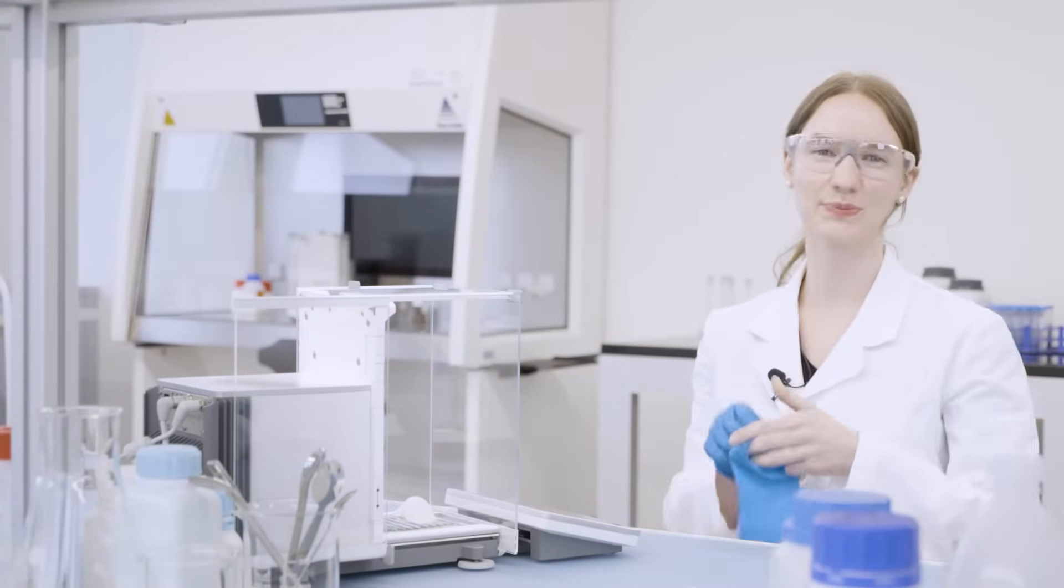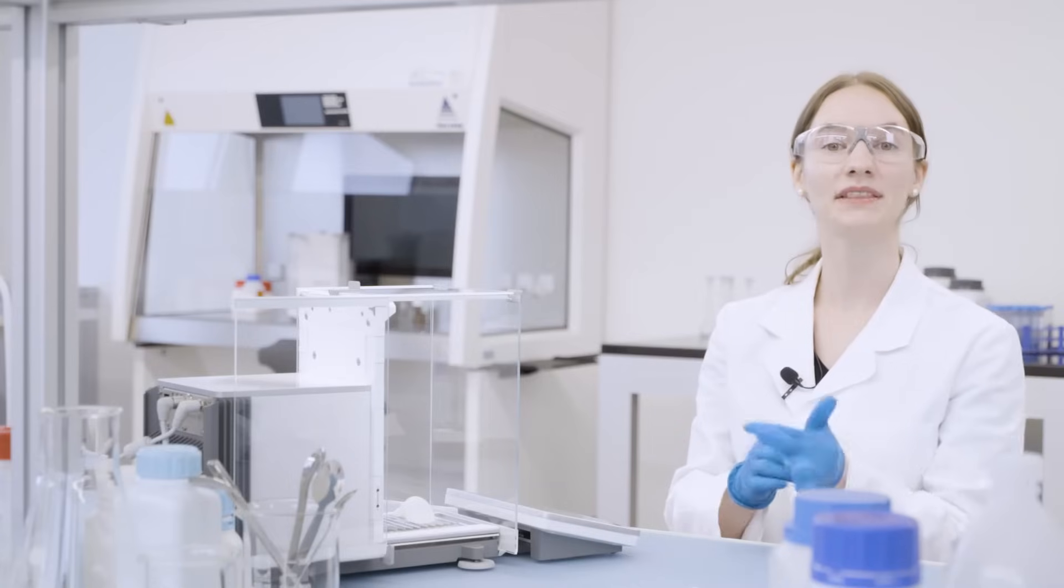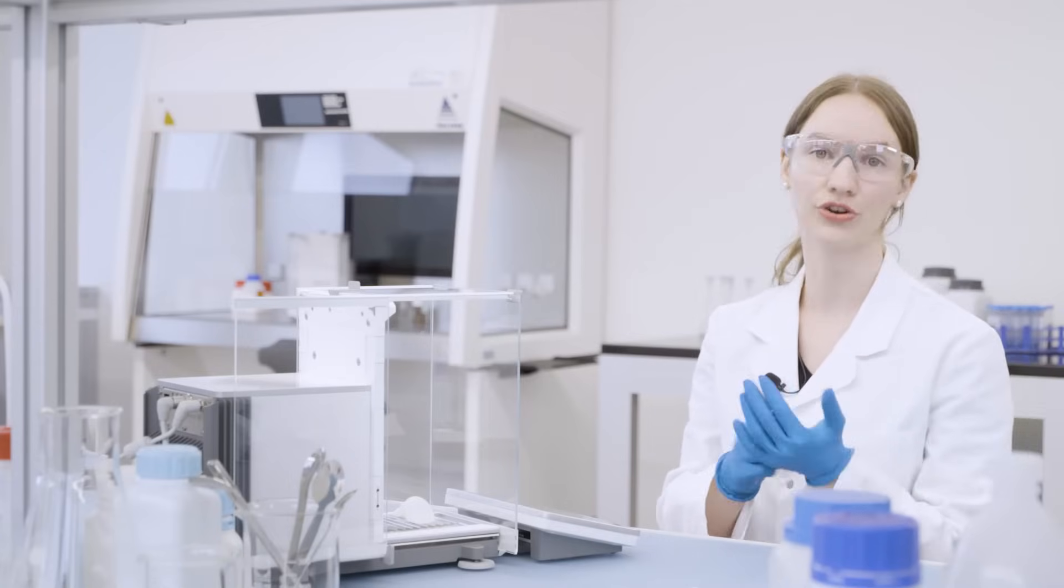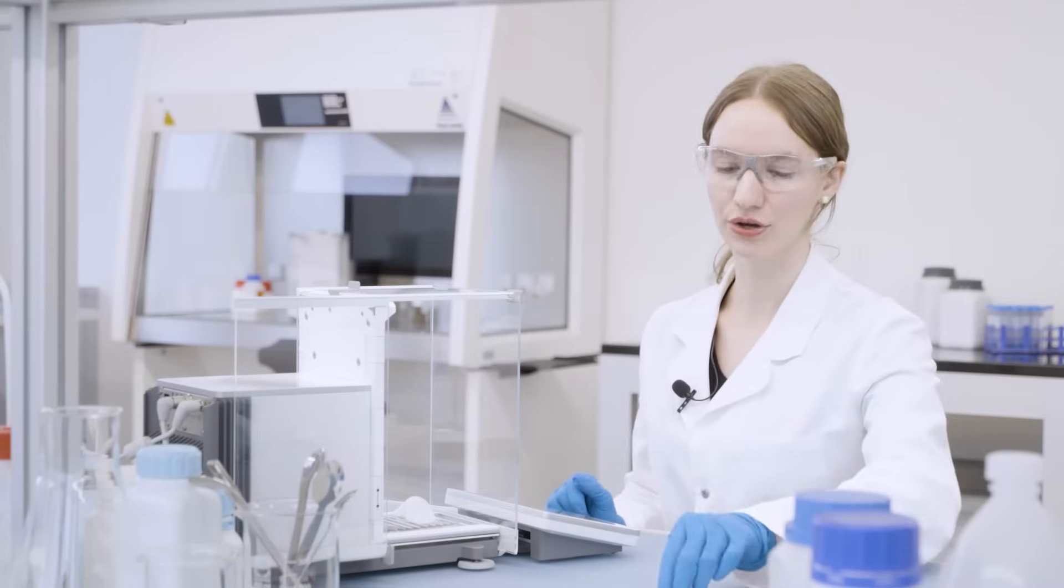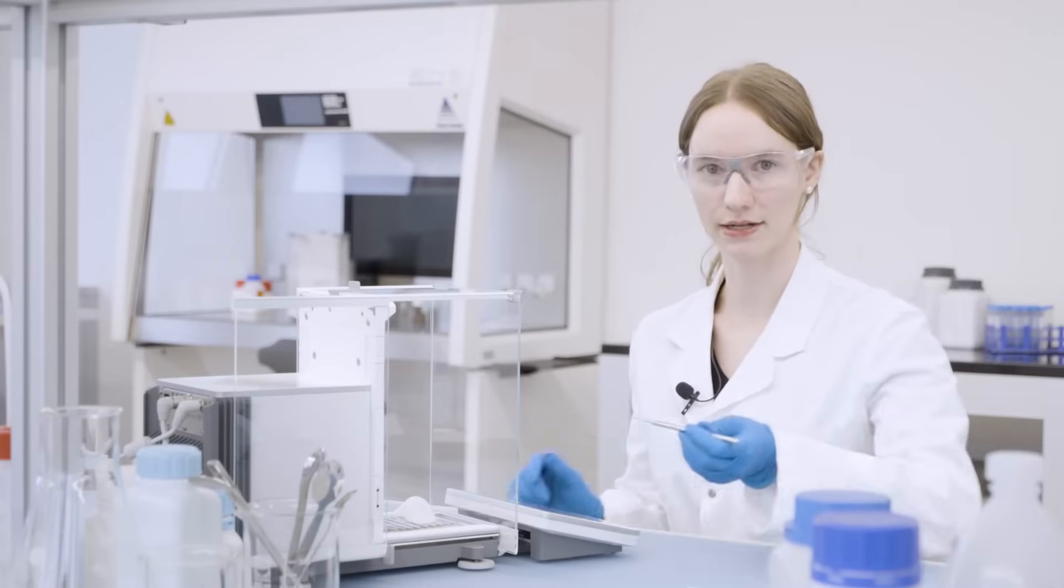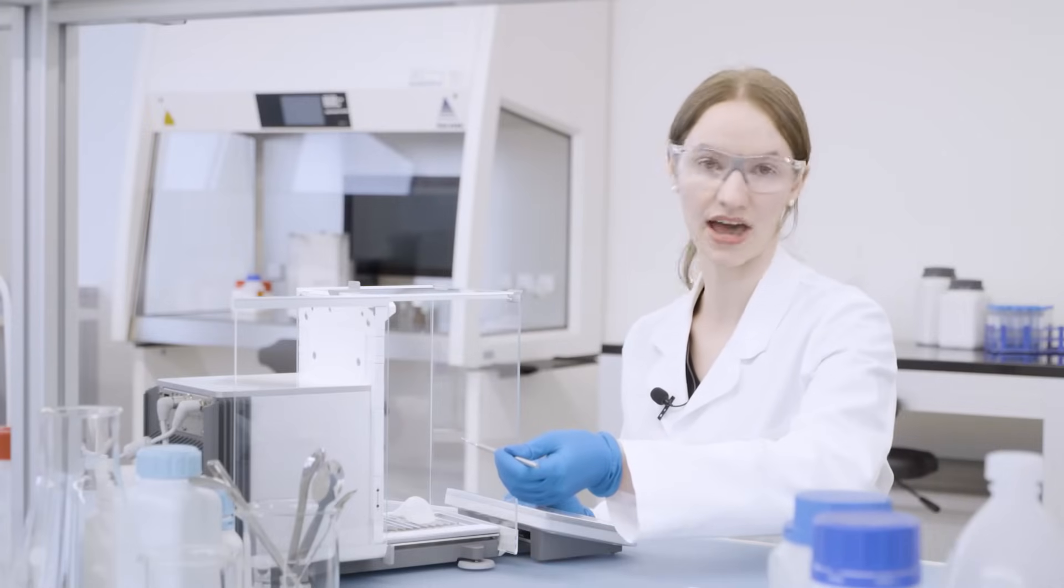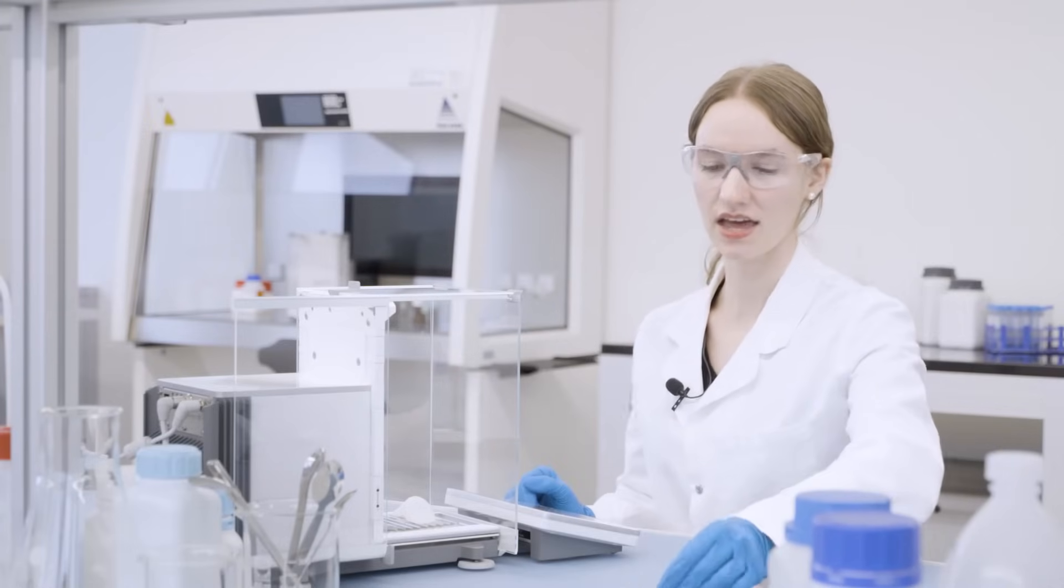To complete the XPR user experience, we have made the balance easier and more ergonomic to use. With a 30% larger weighing pan, you can now comfortably place your hand on the table instead of having to hold it steady.